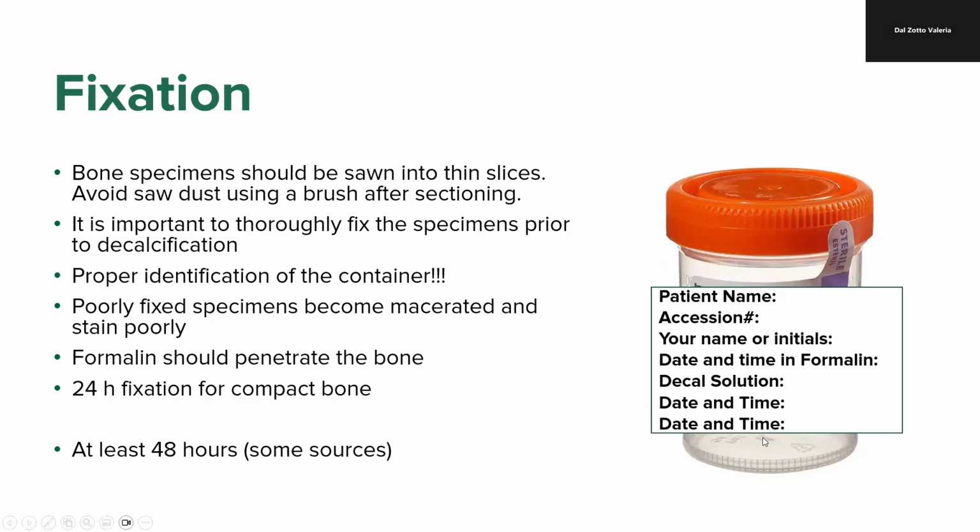Now, let's pretend that it's Friday and you are putting a piece of bone in the decalcifying solution. You are pretty sure, because you are confident, that it's not going to be dissolved completely by Monday, because you use a slow decalcifier. But on Monday, you are not going to be on service anymore.